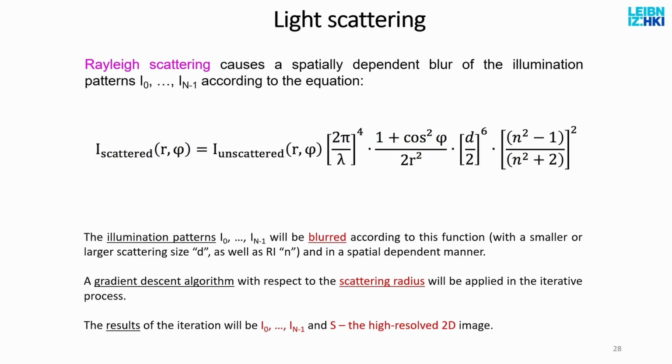Or you take nanoparticles to deliver drugs to kidney or liver or whatever, and you want to know the size of the nanoparticle. Instead of looking through a microscope at 100 nanoparticles, you dissolve them in a colloid, illuminate it with a laser, and measure the scattering pattern. And from that you can calculate the diameter.